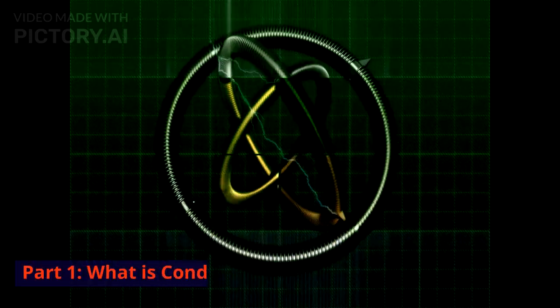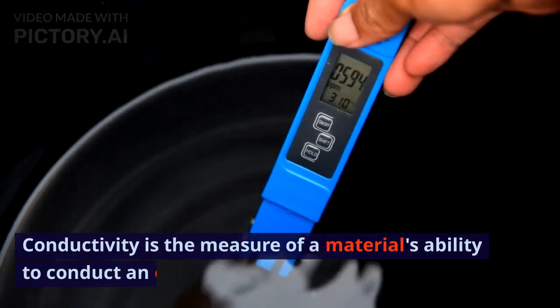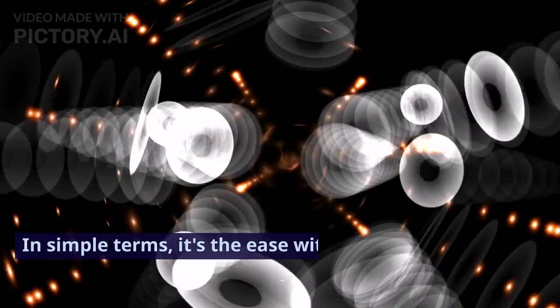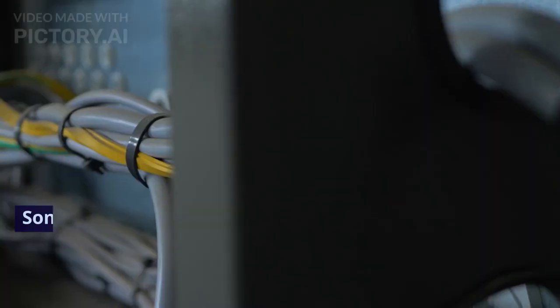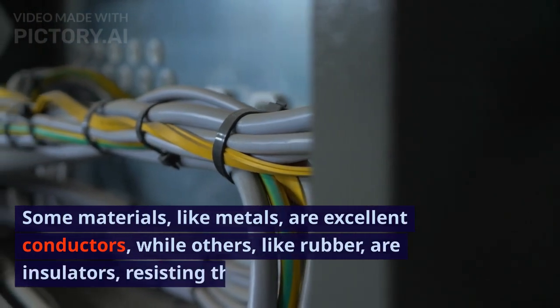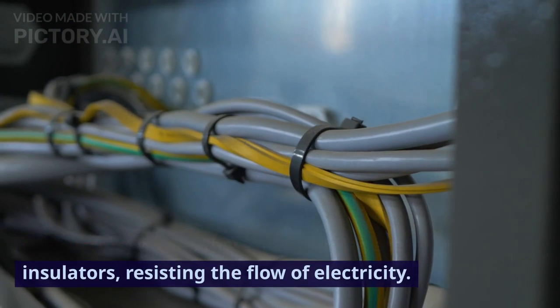Part 1. What is conductivity? Conductivity is the measure of a material's ability to conduct an electrical current. In simple terms, it's the ease with which electricity flows through a substance. Some materials, like metals, are excellent conductors, while others, like rubber, are insulators, resisting the flow of electricity.